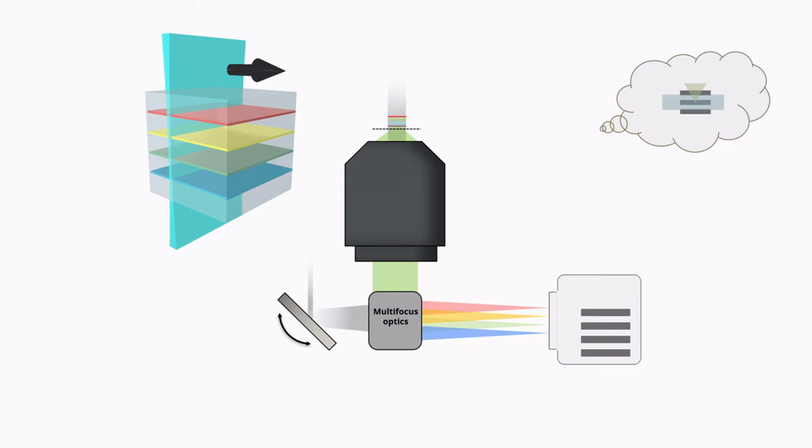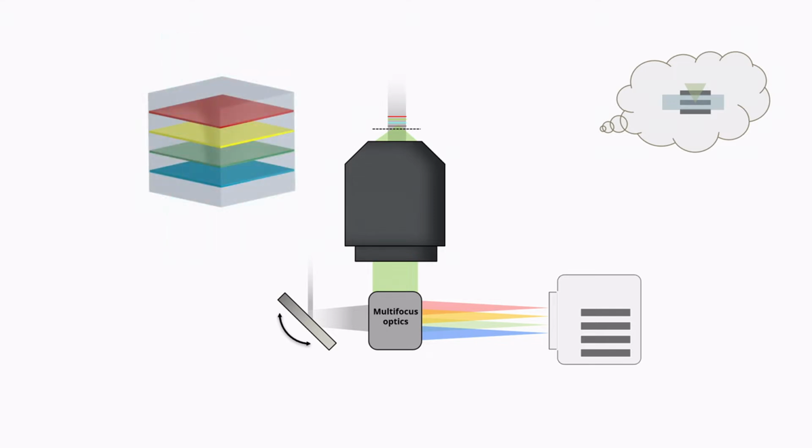So as you scan it through and the camera is just exposing during that time, you end up with basically wide field illumination. So you have all the out-of-focus light still there. So that does not work. What you have to do is something else.